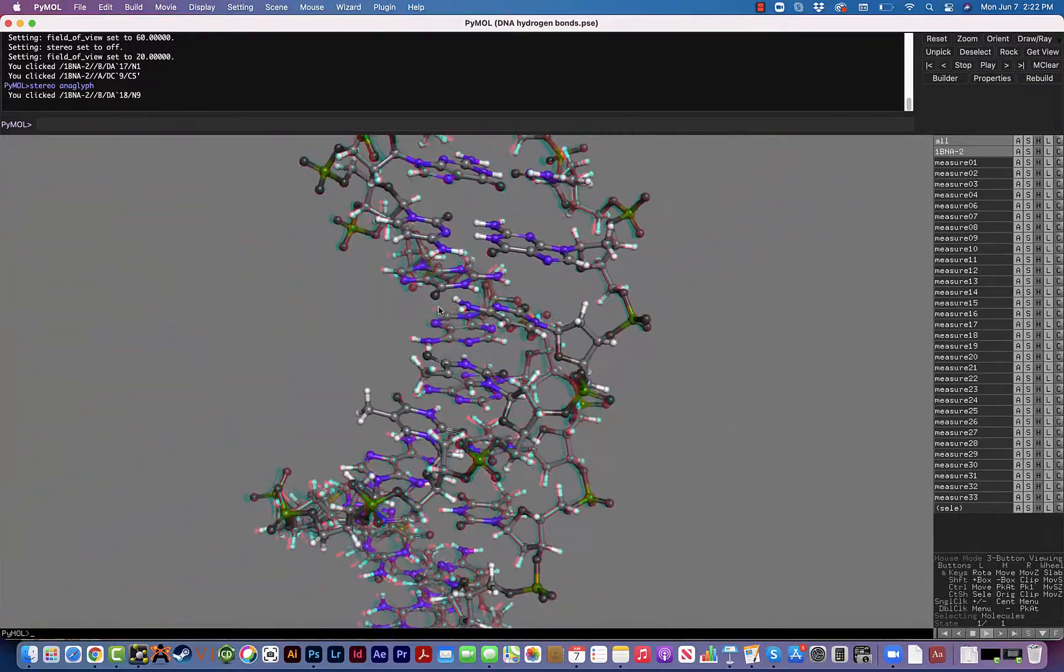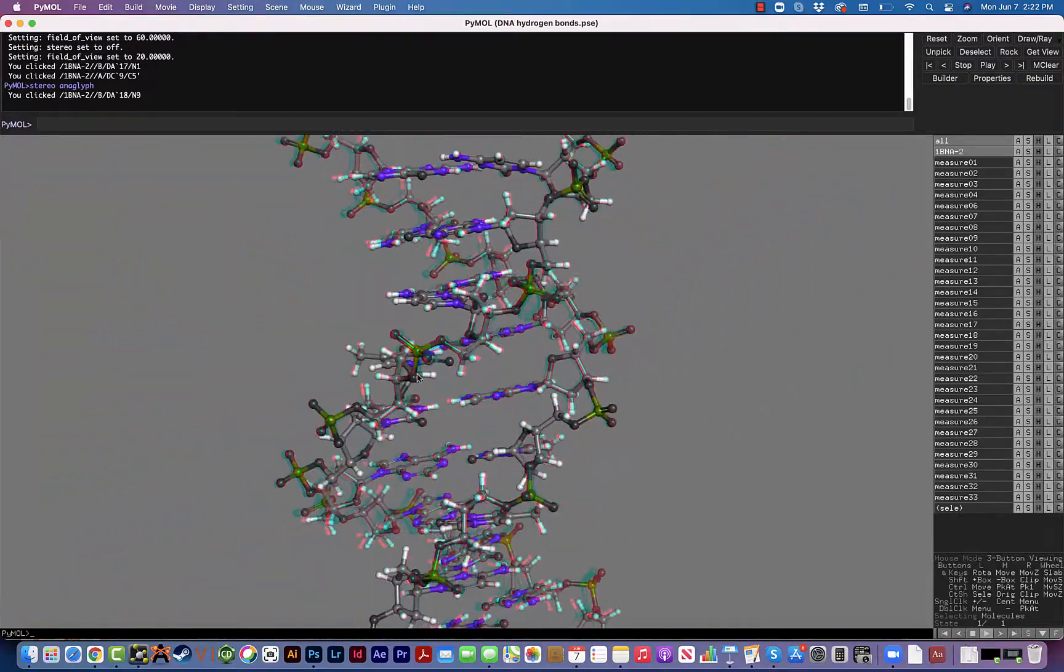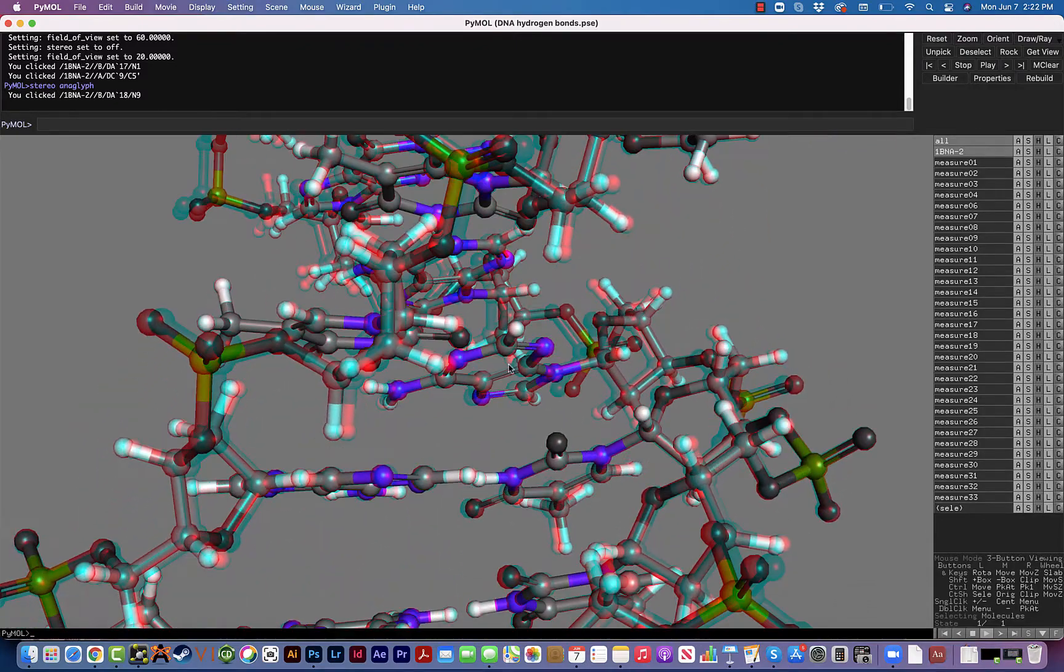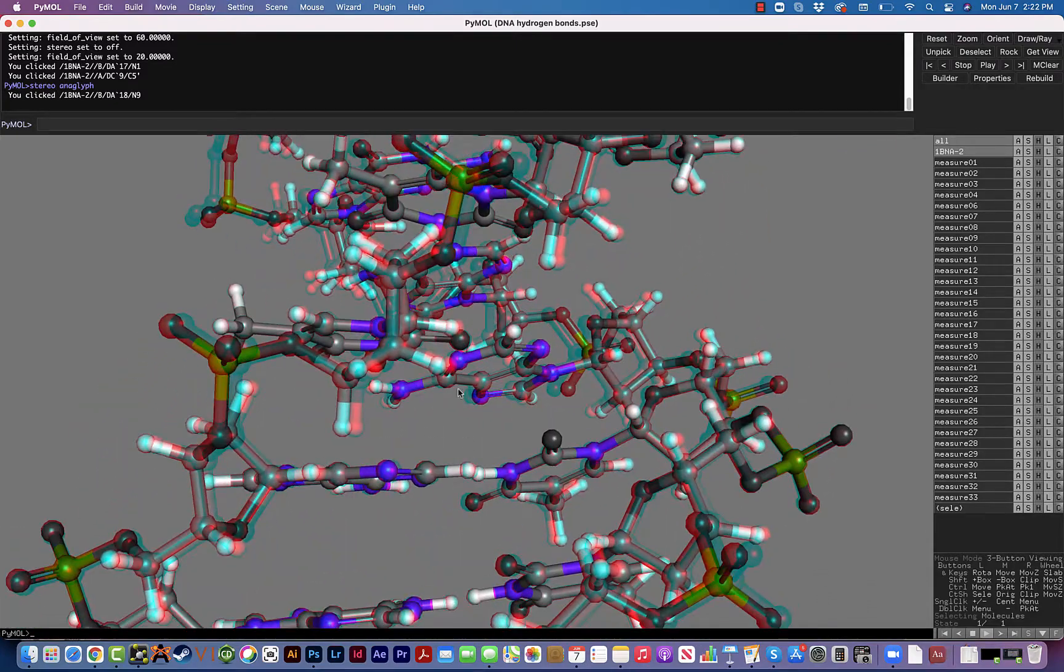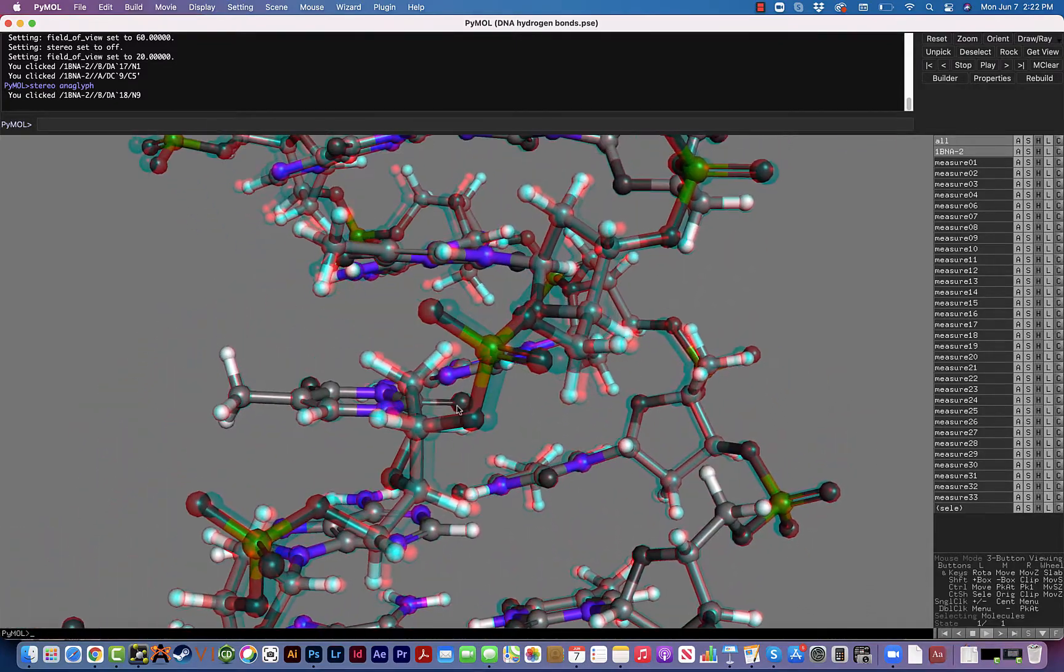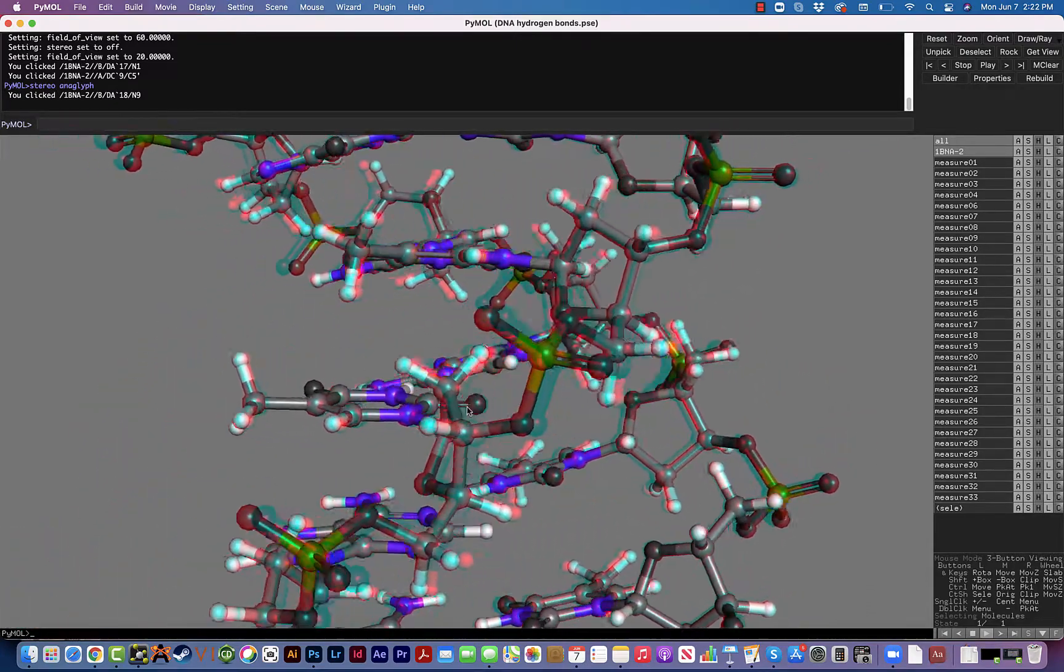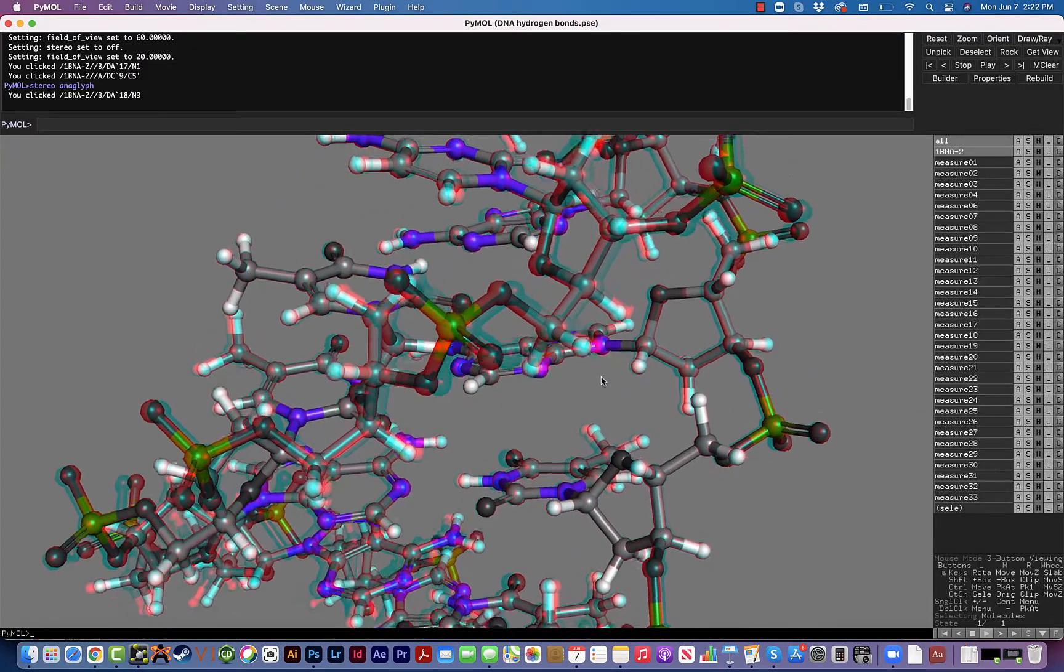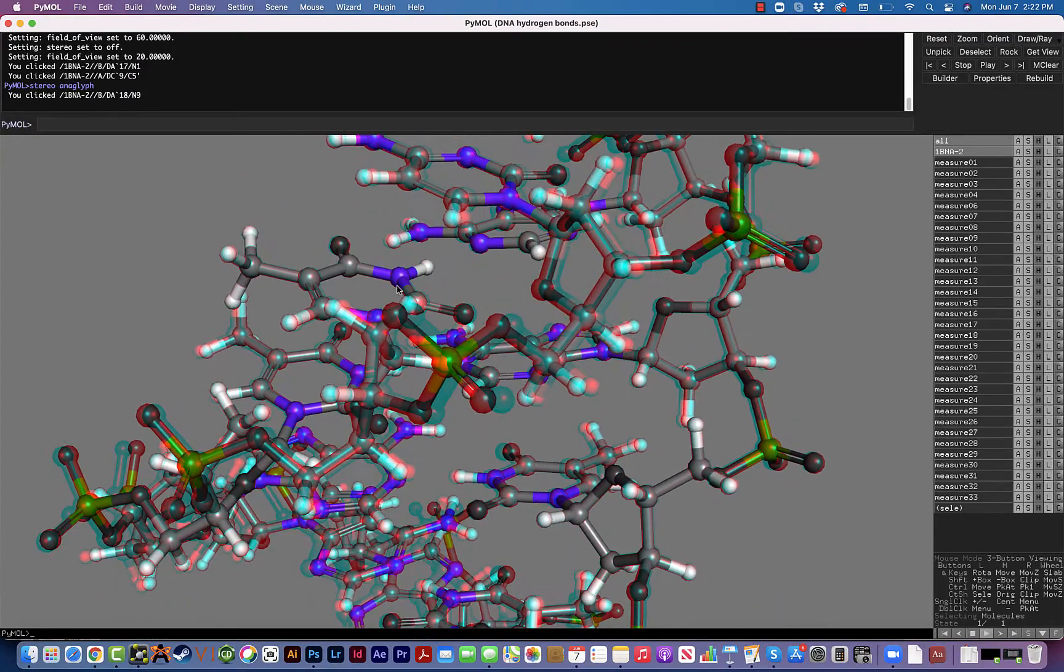So that's really all there is to turning on the stereo view and using those 3D glasses. There's going to be one other thing that I'm going to show you that enhances this view even more.